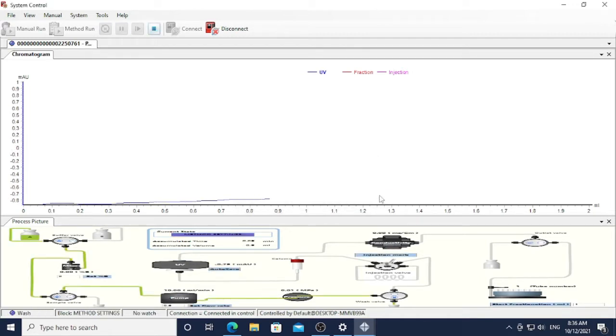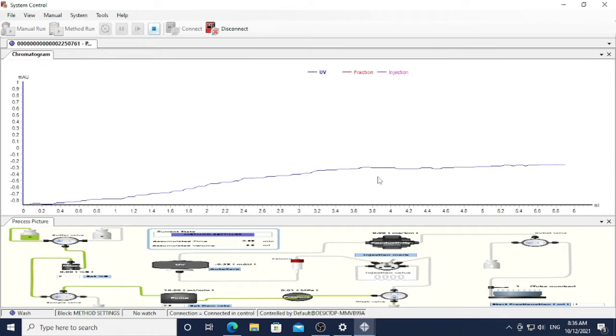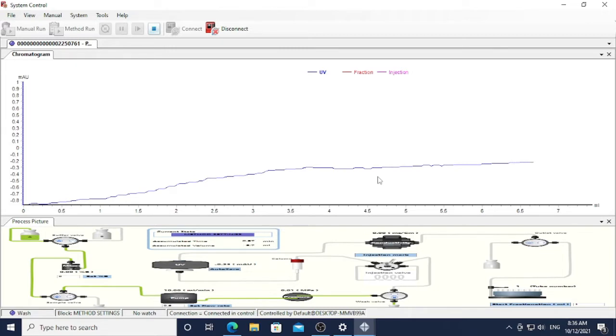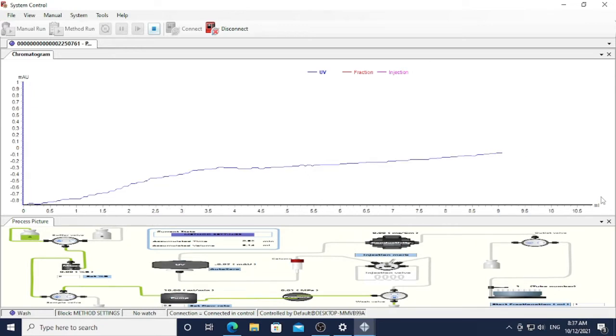During the washing of pump A, the absorbance reading does not accurately start from zero — that is not a big problem. As long as when you start injecting your sample, your absorbance reading should start from zero. The cleaning of pump A takes around two to three minutes, and the washing volume can go up to 10 ml. When finished, a notification sound will come up.